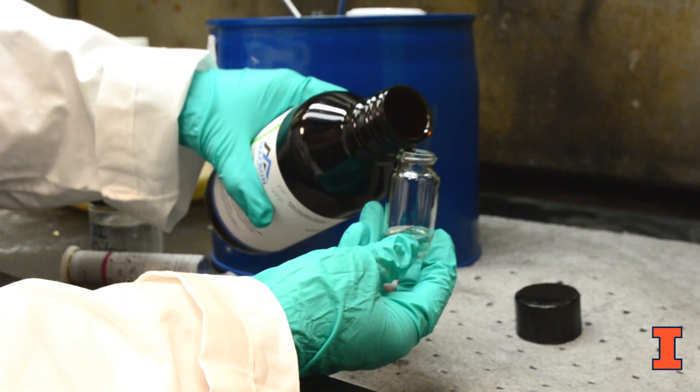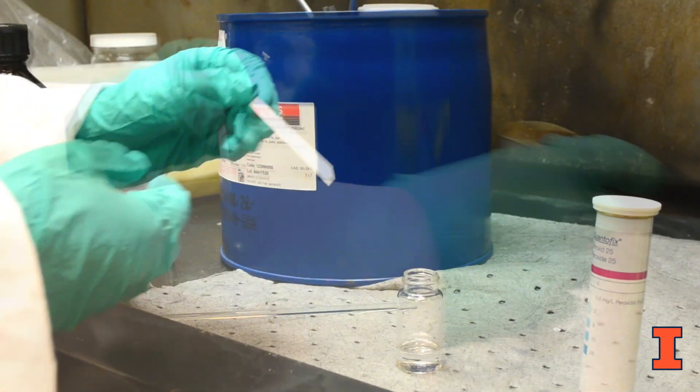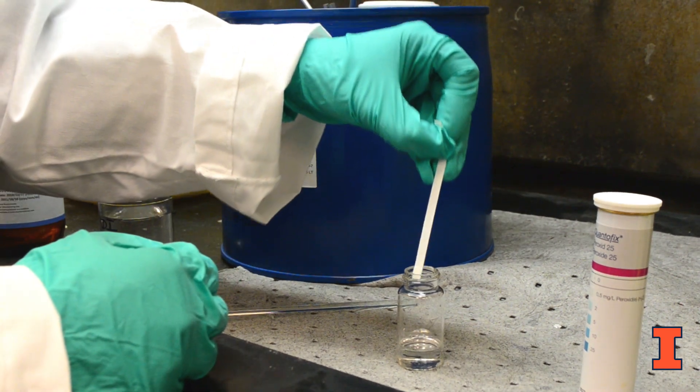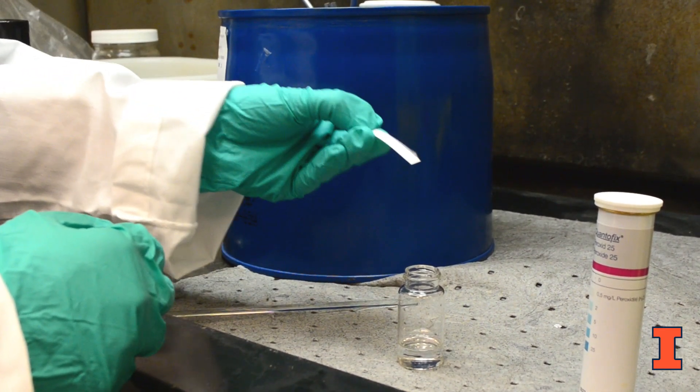To test for peroxides, take a small aliquot of your chemical in a beaker. Remove a test strip and dip into the solvent for about a second. Shake off any excess solvent.